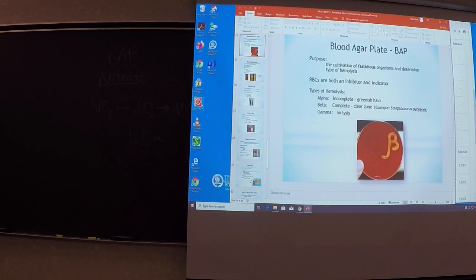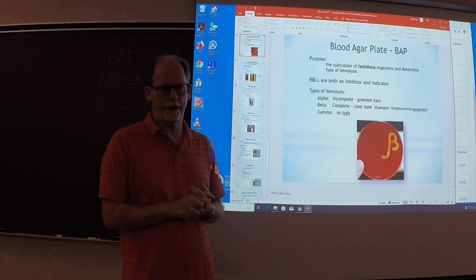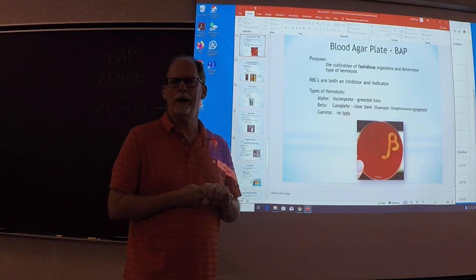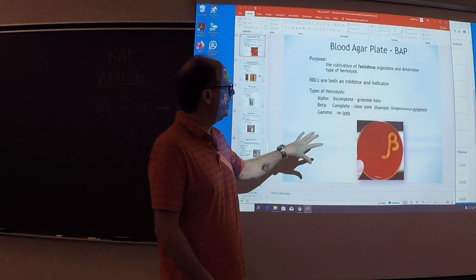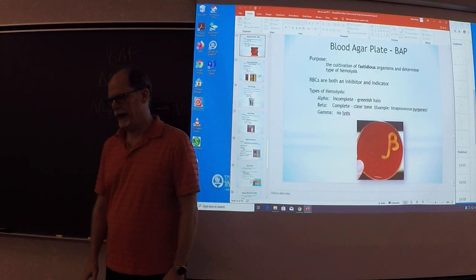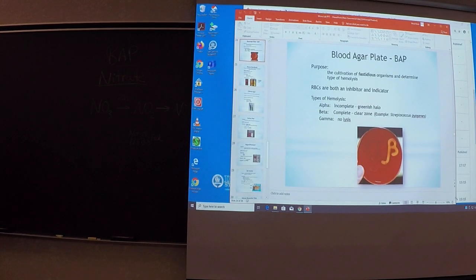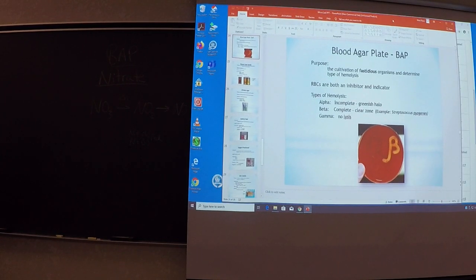Okay, so this is lab video 5, and I'm going to cover the BAP, the nitrate, Snyder, and Kirby Bauer in this video. So the blood agar plate, you're not going to be doing a P&P for this assignment, but you may see some questions about it on the practical exam.